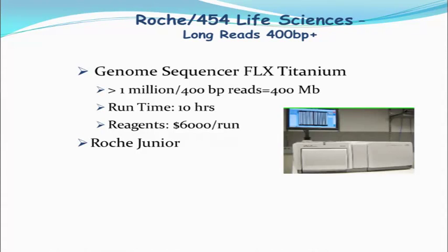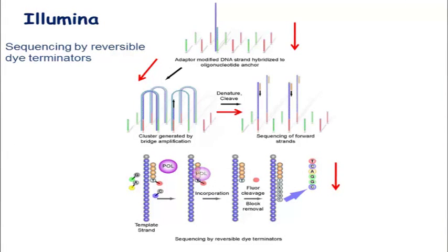And this is the Roche 454 platform. This is a large scale instrument, and there's a small scale instrument also available. Now the more popular instrument is the Illumina instrument series, and here will be the workflow for these platforms.